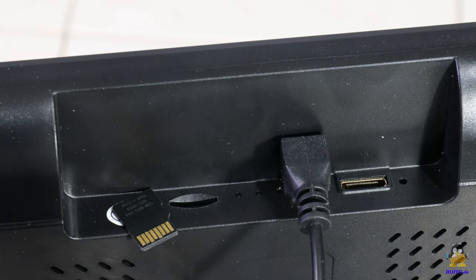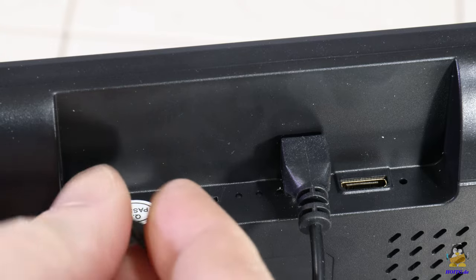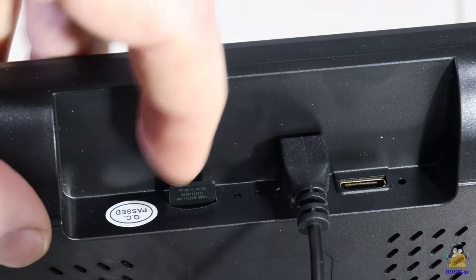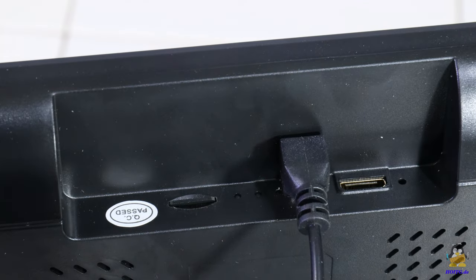Image data is stored on a microSD card, which, somewhat difficult to reach, is inserted at the back of the screen. The microscope must be switched off when changing the SD card.